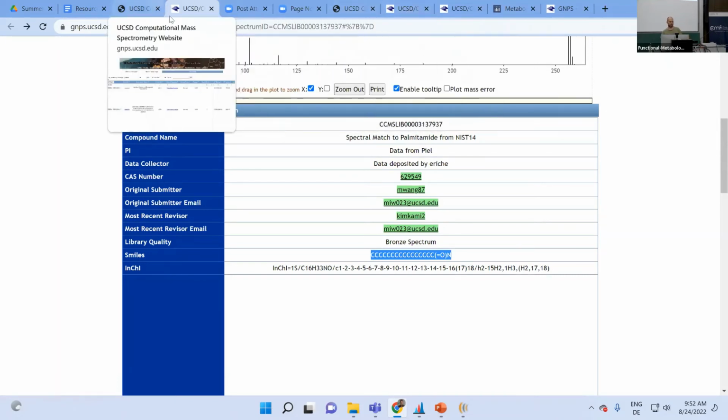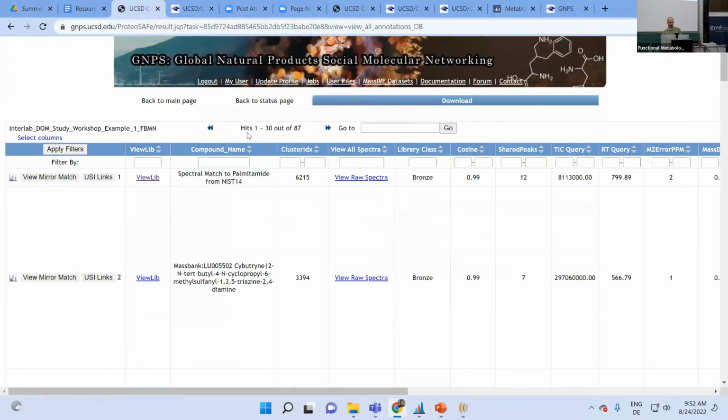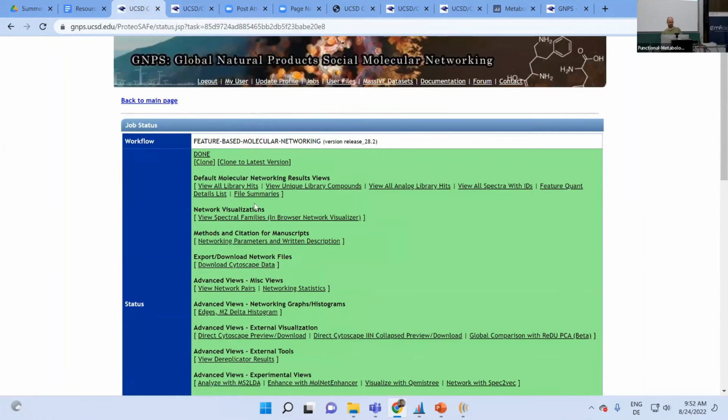And now if, let's say, I go to the network view, or the cluster view, where I can look at all nodes in this network, then I would go to cocaine, open up the network view, and check, is it connected to the other compound that I know? So that's one way, but it does not apply to all chemical classes. I think really understanding the principles underneath it, and knowing your data set a little bit is important, but there's certainly no perfect answer.